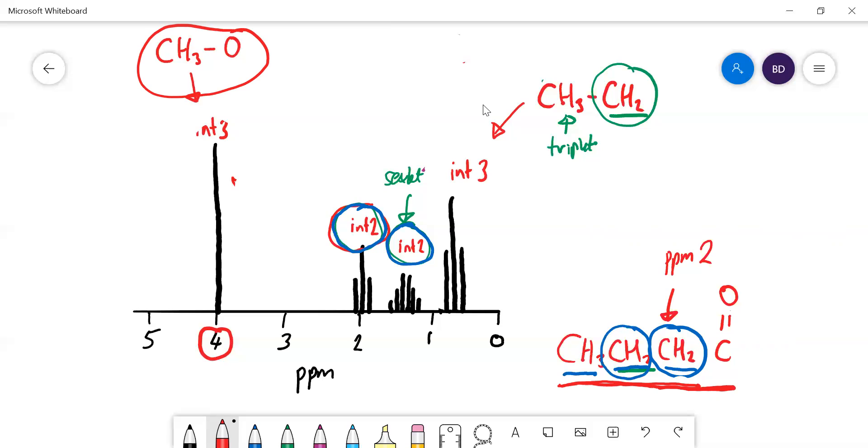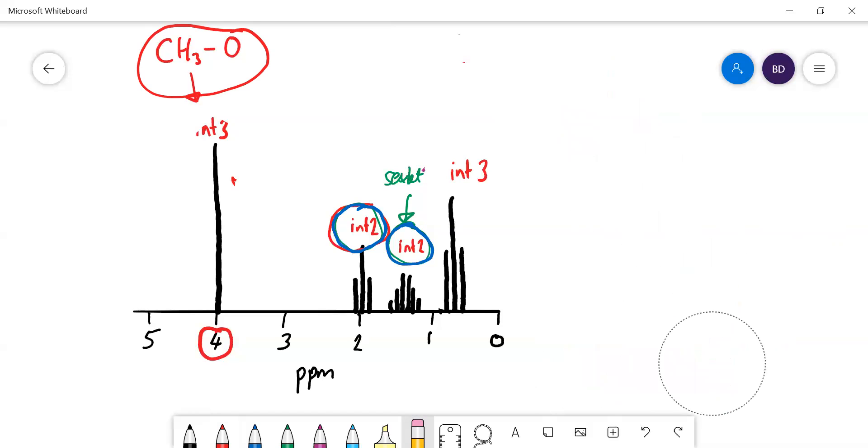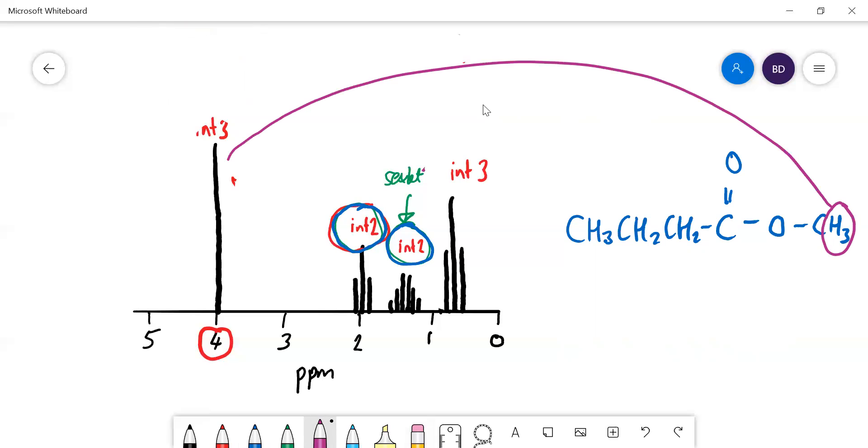Sorry if there's a bit of noise in the background, the bin men are just outside collecting the bins. So let's draw the whole thing out, what we've got. Let's go through what's what then. This CH3 is that peak there. High ppm because it's next to the oxygen. Singlet because there's no carbon with hydrogens on it there.